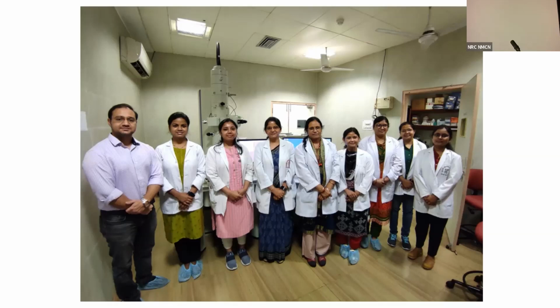And you have to realize that the amount of tissue that you are looking at in an electron microscope is very small. Not so small as it appears; at one time we even see 3, 4, 5 lobules in the same section, but otherwise it is relatively small. So if you see a small area and say these are just sparse granules, these are just dense granules, that will not be right.